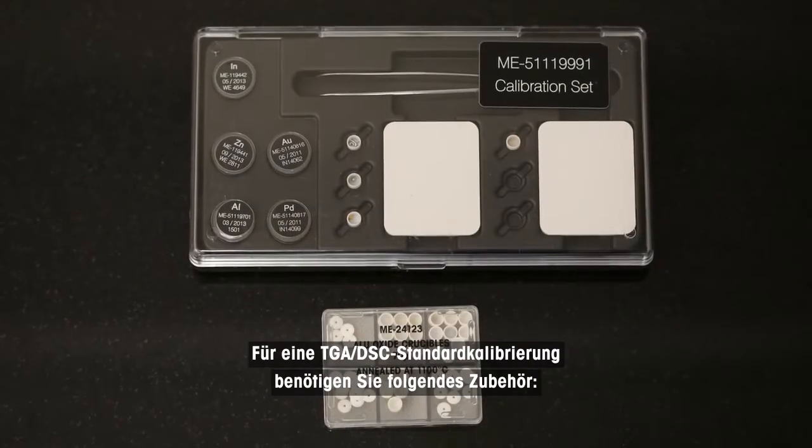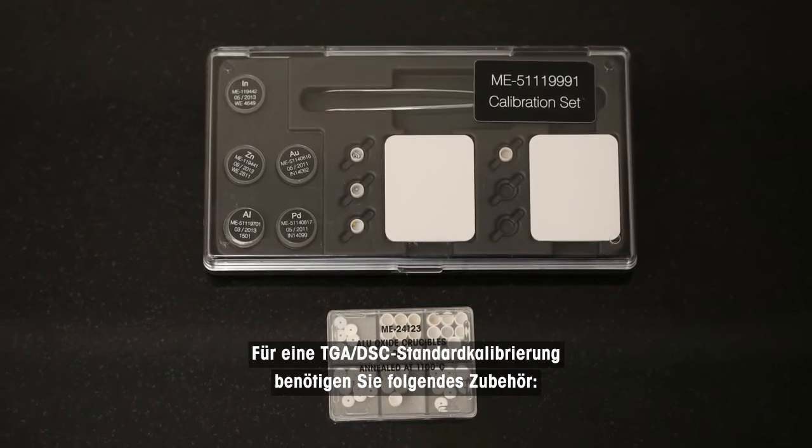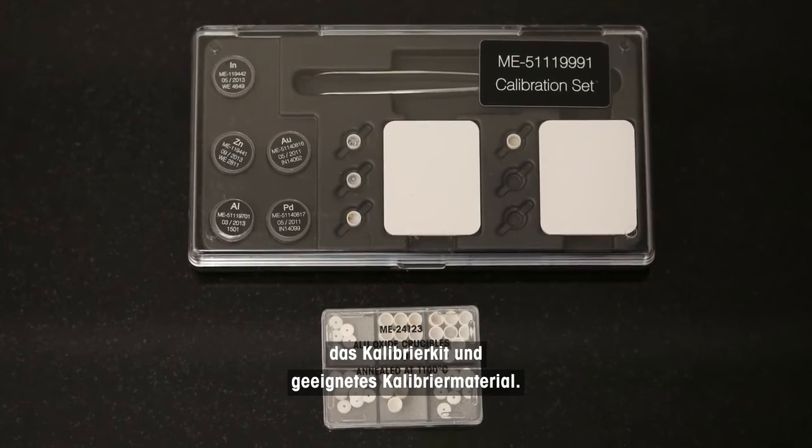For a TGA DSC standard calibration, you will need the following accessories: two standard 70 microliter alumina crucibles, the calibration kit, and suitable calibration material.